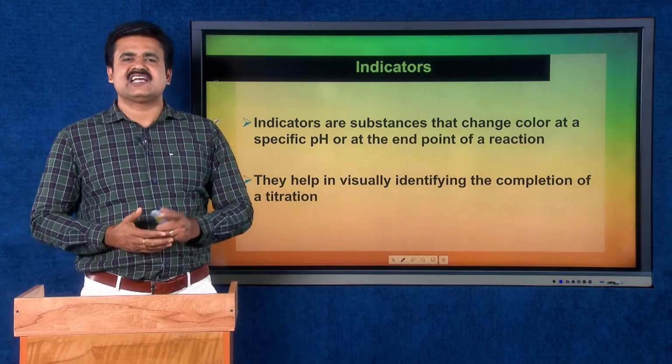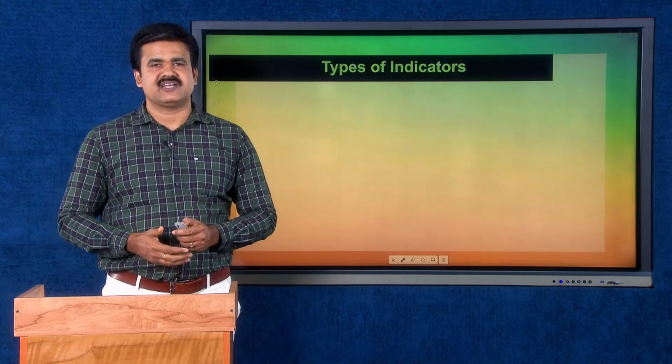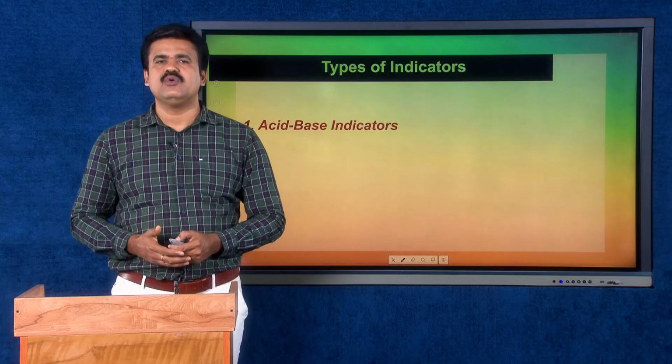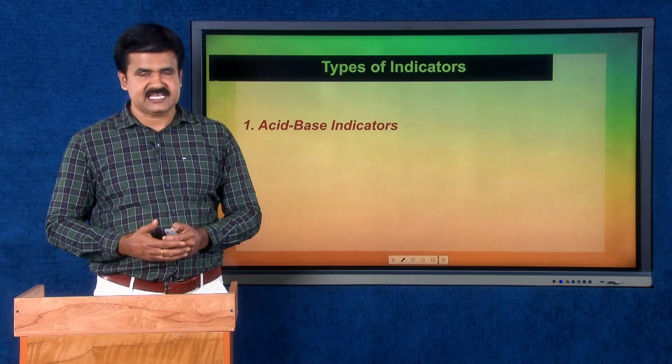These indicators help in visually identifying the completion of the reaction or completion of a titration. Now we are having a discussion on various types of indicators.